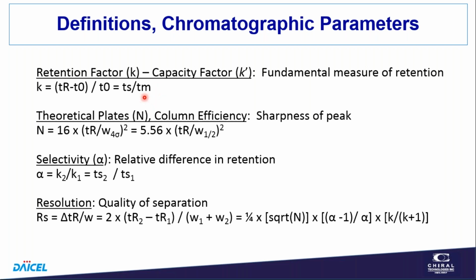the analyte moves at about the same velocity as the bulk mobile phase when it's in the mobile phase. So we can substitute t0 as the time in the mobile phase, and we can know the time in the stationary phase, because it's a difference between the retention time and the time in the mobile phase. So this is a fairly simple calculation. It looks a little arcane, but if you think of it really as a partition coefficient, that becomes fairly useful.